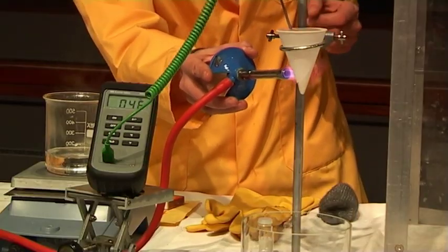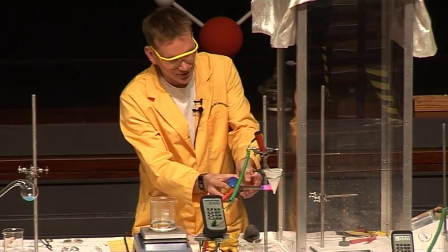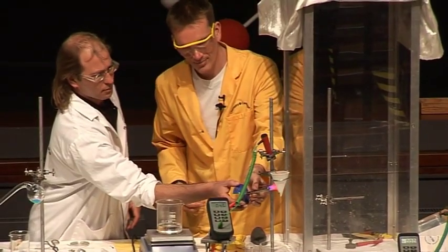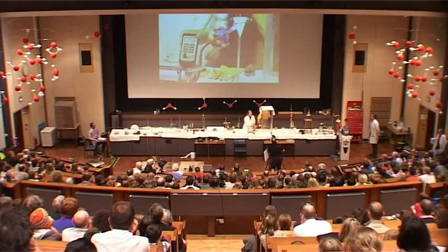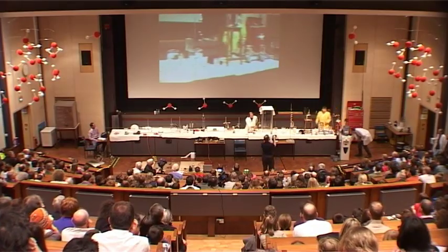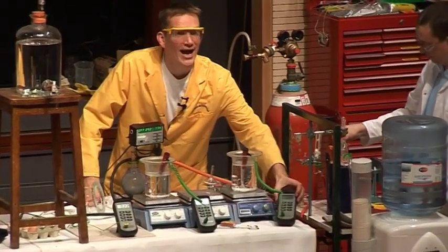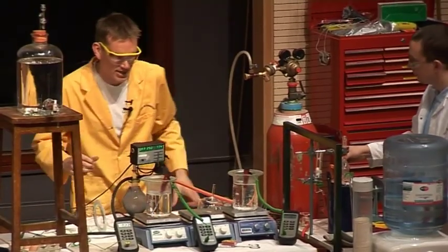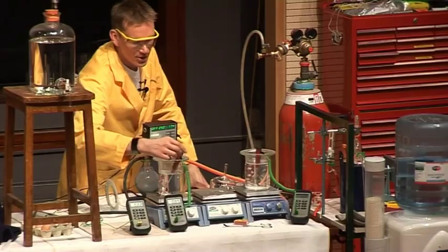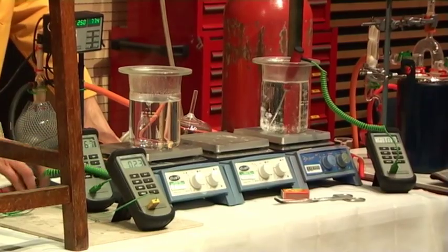Actually, I think Chris can give me a hand with this, please. So, Chris, where is Chris? Here he comes. Perhaps you can just give me a hand heating up the water, please. Okay? Keep that there. Don't burn it. Thank you. Now, I have some water over here that we're actually heating up. This water, as you can see on the scale here, is boiling, and it's boiling at 100 degrees C. This water over here is only at, well, it's 85 at the moment. But we're going to see if we can make this boil at a temperature less than 100 degrees.